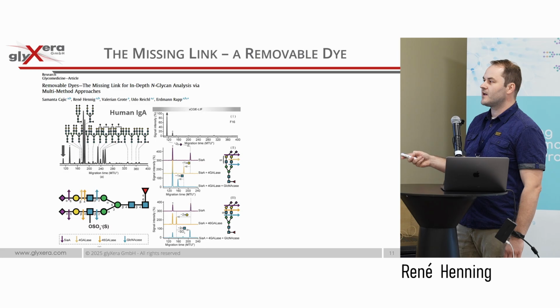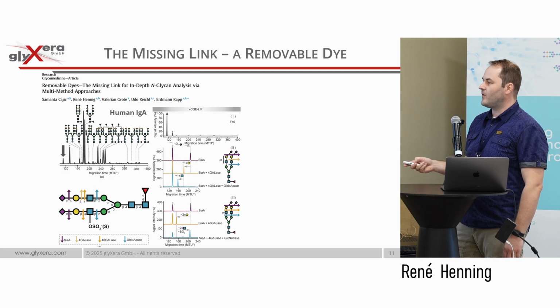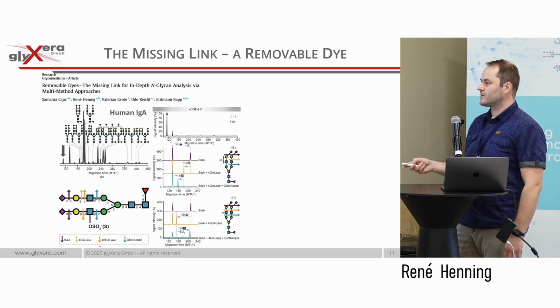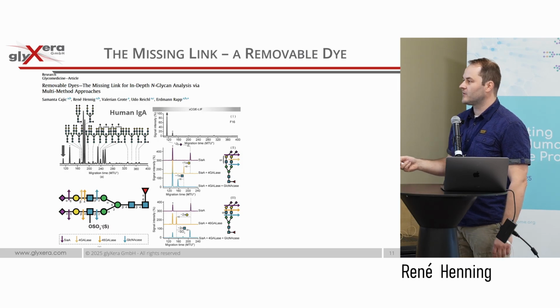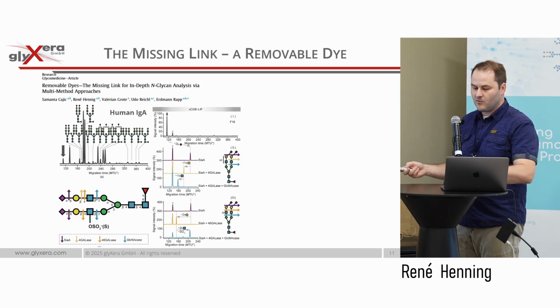So this means we were not able to remove the sulfate. And this time, we found another galactosidase which was able to cleave both at the end. So it cleaved both, and what you see is getting smaller. It's going to earlier migration times. This means the sulfation is not attached to the galactose like we expected in the beginning. But if you remove both GlcNAcs, you can see it's shifted there. It's getting bigger, or getting to later migration times. So the sulfate is actually, by the database, then we could say, okay, it's located on this arm.